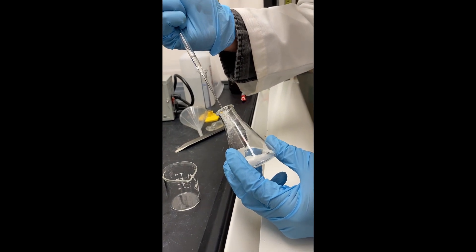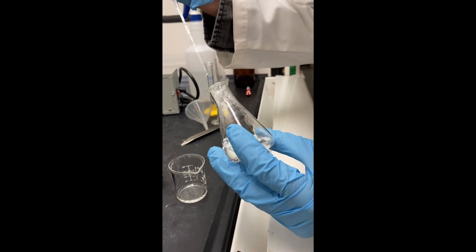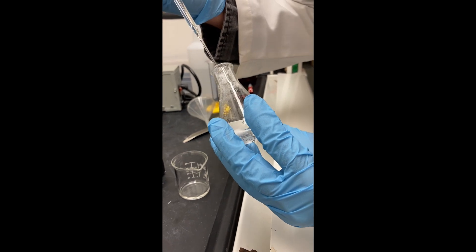Transfer the hexane layers to the beaker. Make sure you don't transfer any magnesium sulfate, since that will artificially increase the mass of our oil.